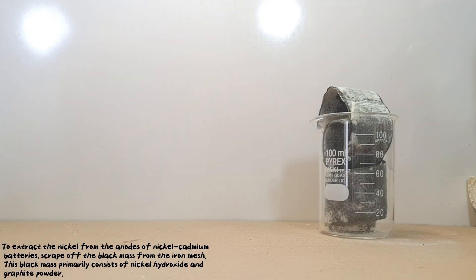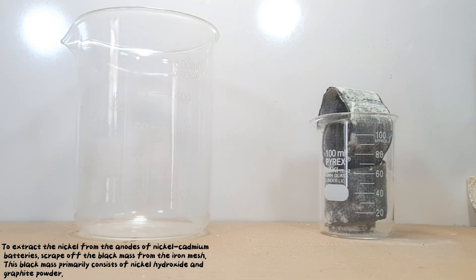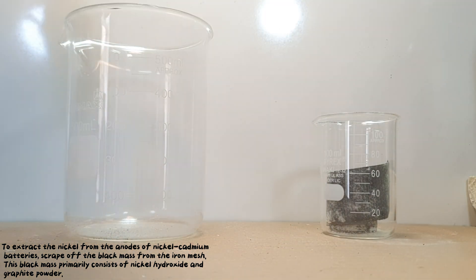To extract the nickel from the anodes of nickel cadmium batteries, scrape off the black mass from the iron mesh. This black mass primarily consists of nickel hydroxide and graphite powder.